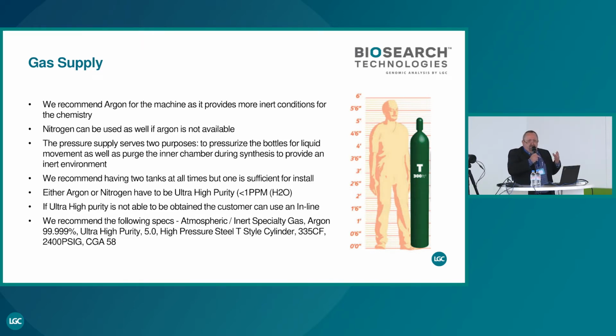When you make oligo for research, for diagnostic, or for therapeutics, you are targeting some purity. It's very important. But in therapeutics, one thing is also very important: what are the impurities? This is something you have to keep in mind. When you do an oligo for research, you don't care so much about the impurity.